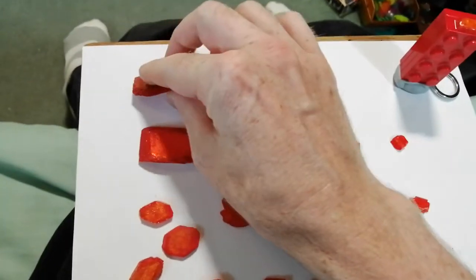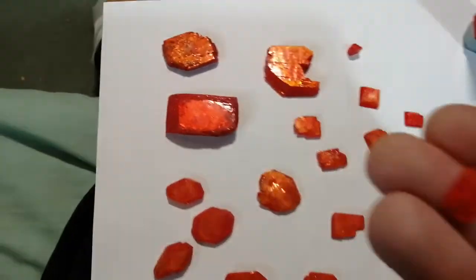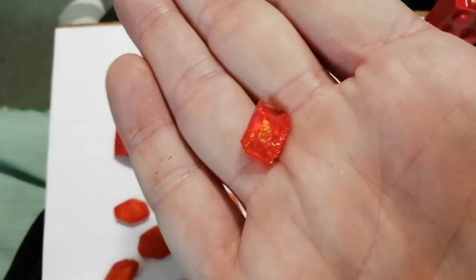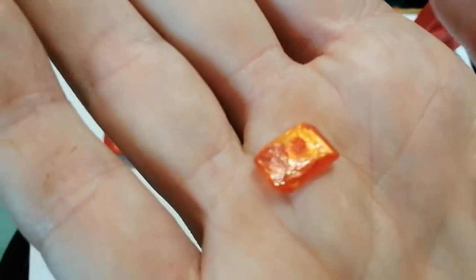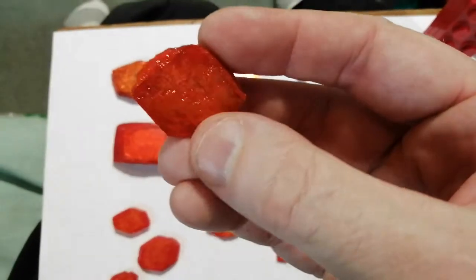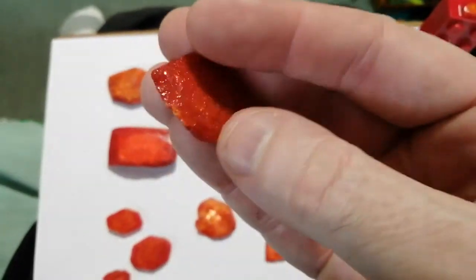Okay, so let's see if we can find a nice example. Here's a tiny one, and that's kind of how they all wanted to end up, and that's what they would have done if I'd left them alone. But I wanted variation, so I had a tendency to pull them out while they were still slightly diamond or slightly hexagonal in shape.